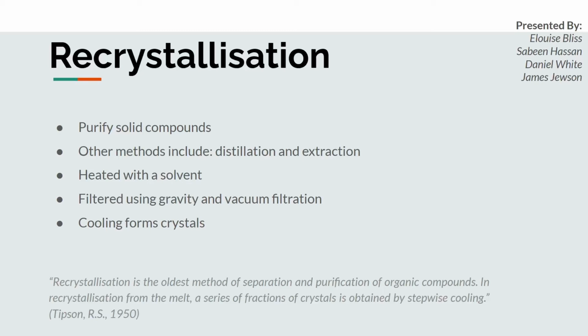To define recrystallization, it is a common purification technique used to purify solid compounds. There's a couple of other purification techniques which are called distillation and extraction, but the one we're focusing on is mainly recrystallization. This process involves a compound meant to be purified, in this case benzoic acid, which is dissolved within a suitable hot solvent, in this case deionized water, and subsequently filtered with activated charcoal and finally left to cool slowly to room temperature to fully crystallize.